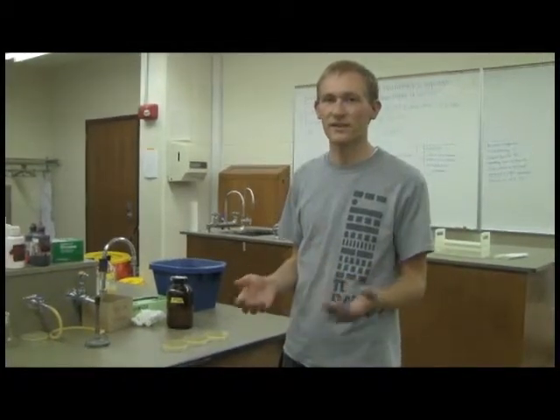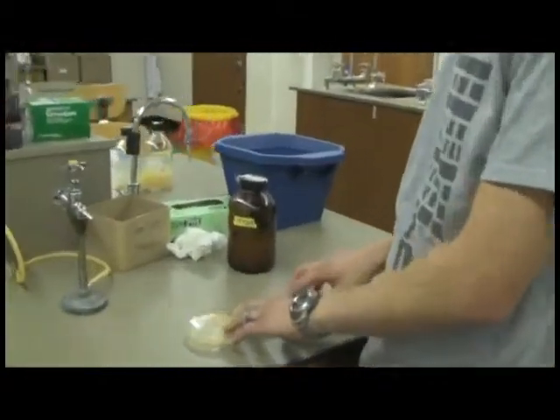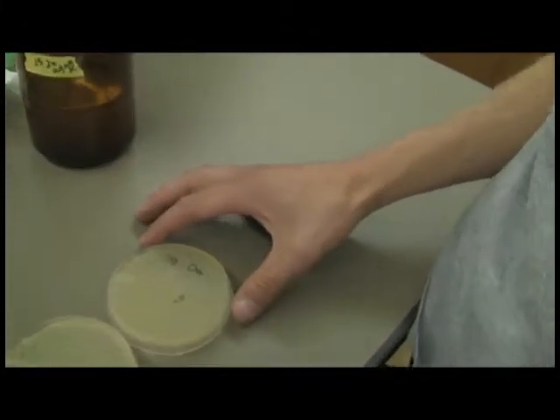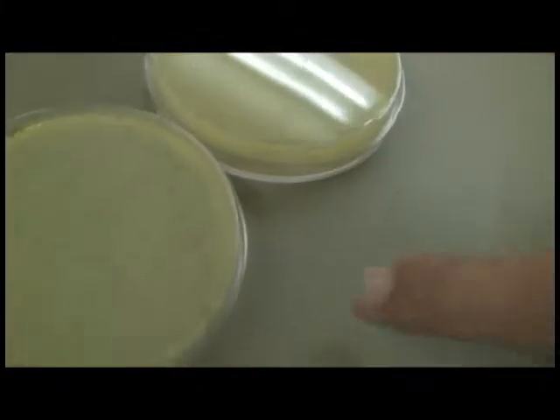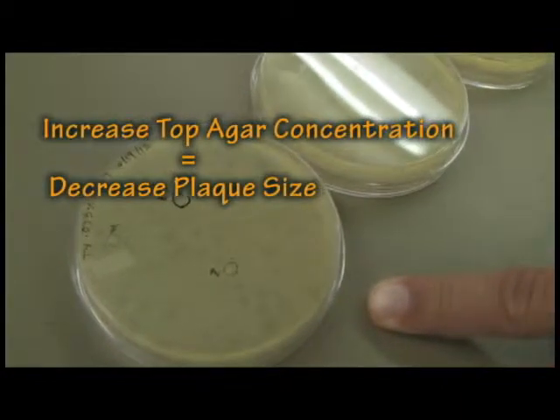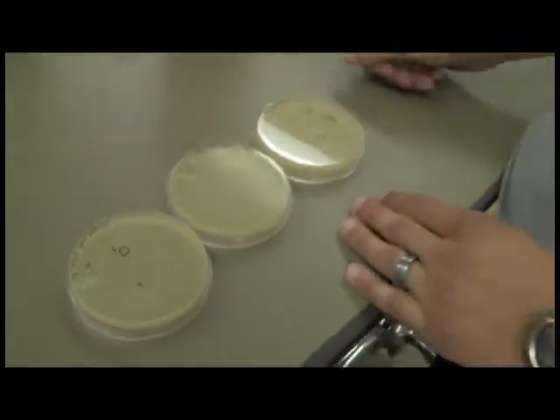That's good. One of the other things that you can use top agar for is varying the concentration of the agar in the broth to change the size of plaques. This is useful if you're selecting for different plaque sizes. This is an example of T4 phage where we use different top agar concentrations, giving different sizes of plaques. This is 0.15%, and the plaques were pretty small, and they get bigger as you move up to 0.1, and bigger still when you move to 0.075%. The same principle can be applied when trying to find small phage, because you can increase the percentage of agar and the plaques get really, really small.